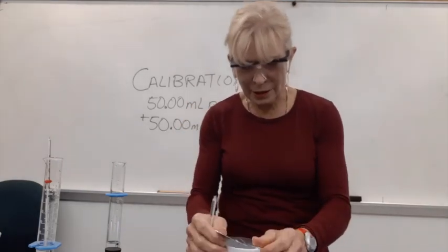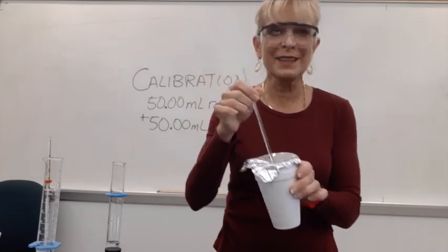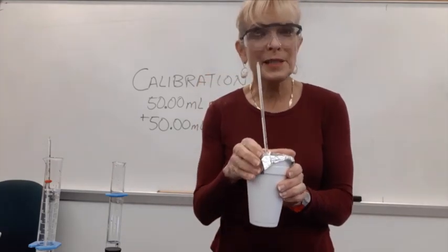Oh no, it didn't work. Punch a hole in the lid. There. Whoa. There we go. Okay, so that's our calorimeter.